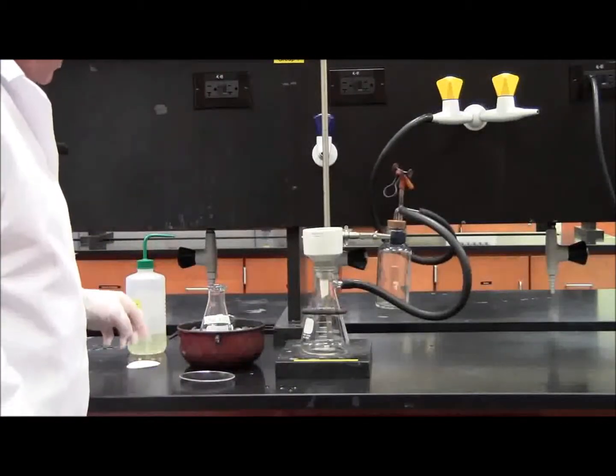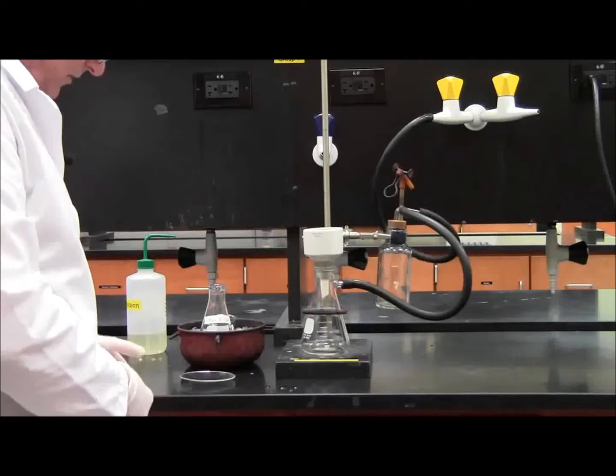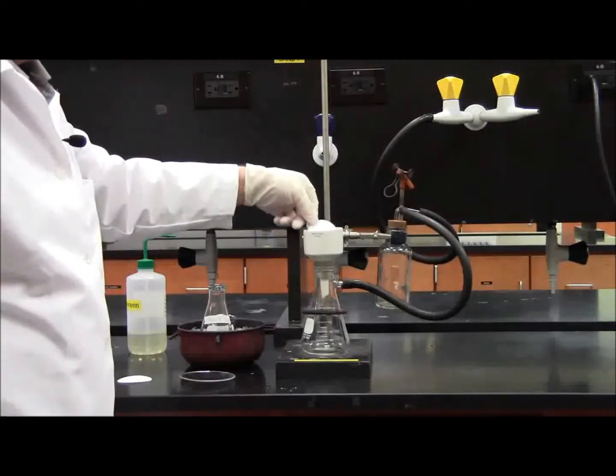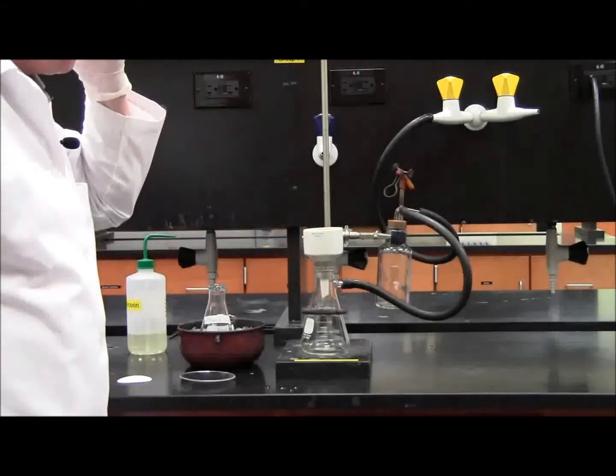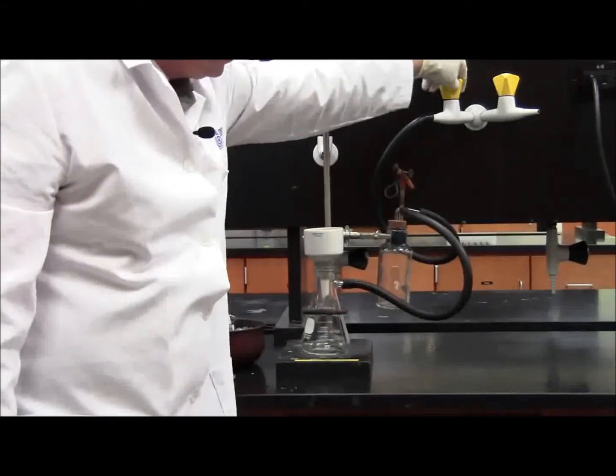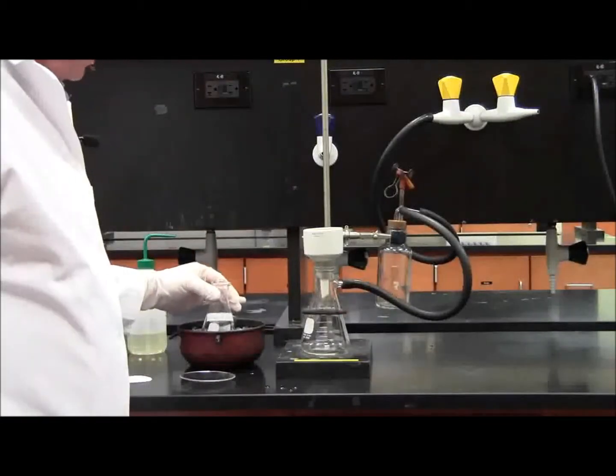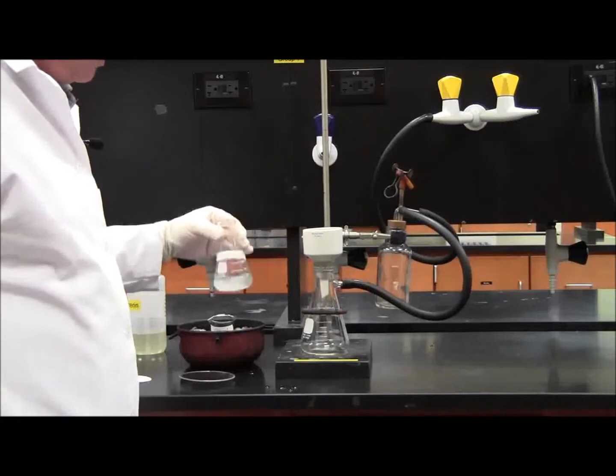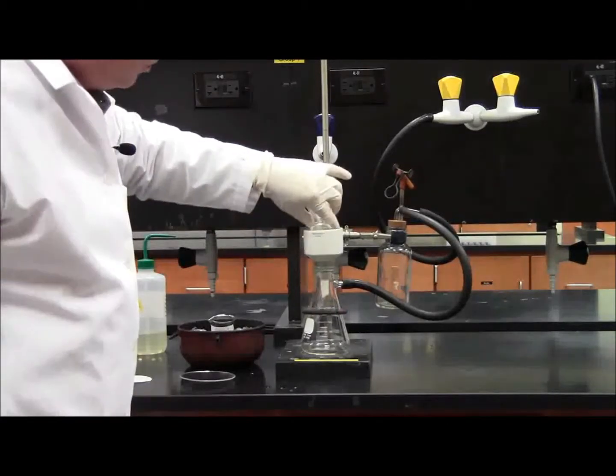Then you're going to want to take one filter paper, put it directly into the center of the Buchner funnel, turn on the vacuum, take the ethanol and benzoic acid crystals, swirl them around a little, and pour them in the center.